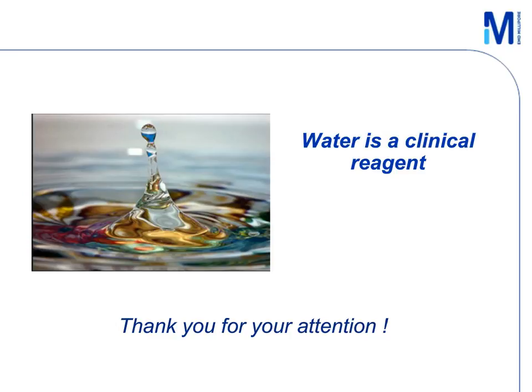Excellent, thank you. And Sean, in your experience, are there any water purification technologies or designs that are particularly prone to promoting bacteria in the water that's produced? Yes. Well, there's what's called service DI, which are basically tanks with regenerated deionization resins. What that technology incorporates is just one dead leg, meaning it's a one-way system to feed an analyzer, and there are these tanks that remove ions out of the water. I mentioned this briefly in the presentation. So with those tanks, when the water is not being called for by the analyzer, water is just sitting stagnant in them. And it's a perfect place for bacteria to grow.